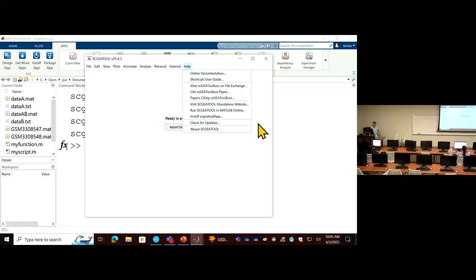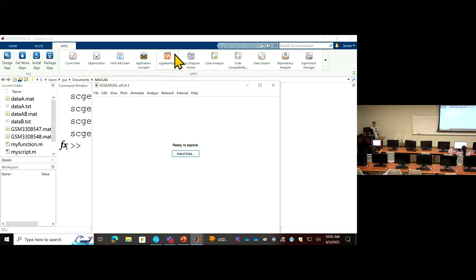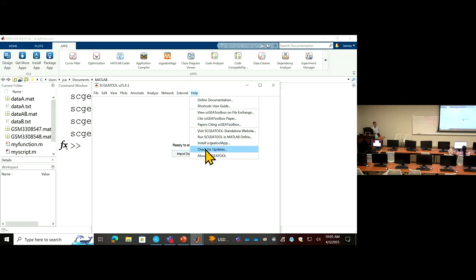Again, what you need to do is check for updates and let the program update itself. Then you install this application, so you can have this orange button in front of you on the top, so you can just click next time to bring up this application. This is a recent update. I have made this feature available for people. You check, yes, it should be in there if you drop down this right here. So you can start it, and you can unstar something else.